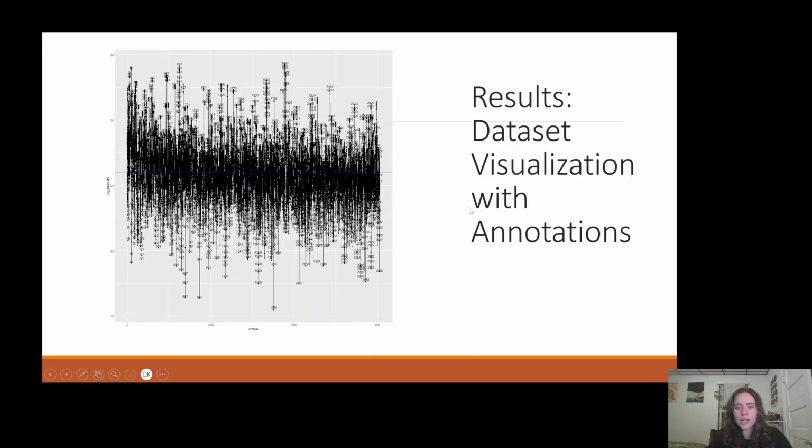And then we add annotations. We add the number, which corresponds to the protein name. So you would have to look up this number in your data set to find the protein name. We do that because if we had the protein name listed for each of these plots, it would get pretty busy. But you could look for proteins which you're interested in using this data visualization.